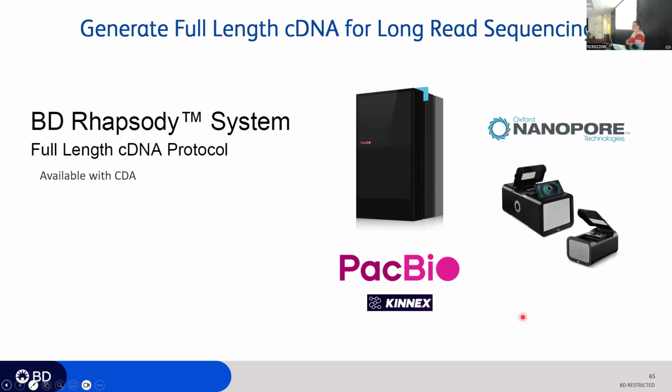So we also have a protocol that we recently published for generating full-length cDNA for those that are interested in long-read sequencing. So those interested in particular isoforms are typically interested in long-read sequencing. We developed our protocol in collaboration with PacBio. We also have the ability to sequence with Oxford Nanopore.